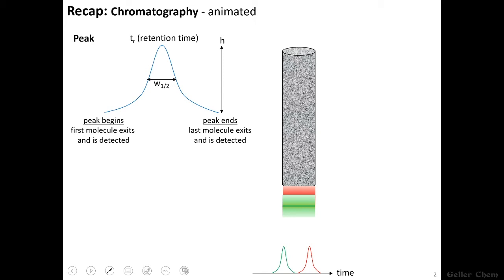But the area, of course, is going to relate to both height and width. And so in previous videos, we already covered why the peak has a width to begin with. In other words, why a band of the same type of chemical would still spread out and some of those particles come out sooner than others. And we're going to get way more into that later.